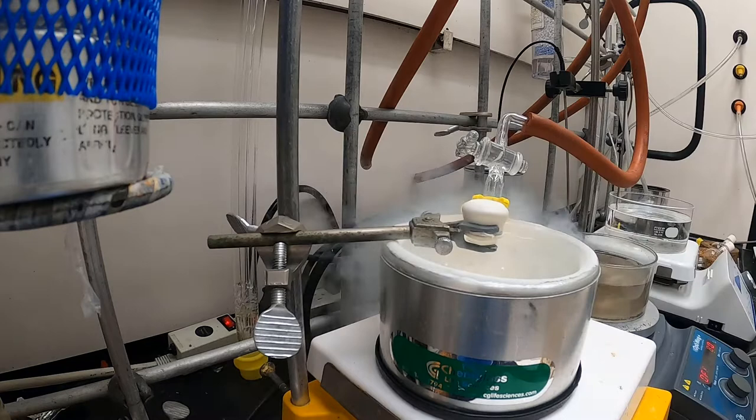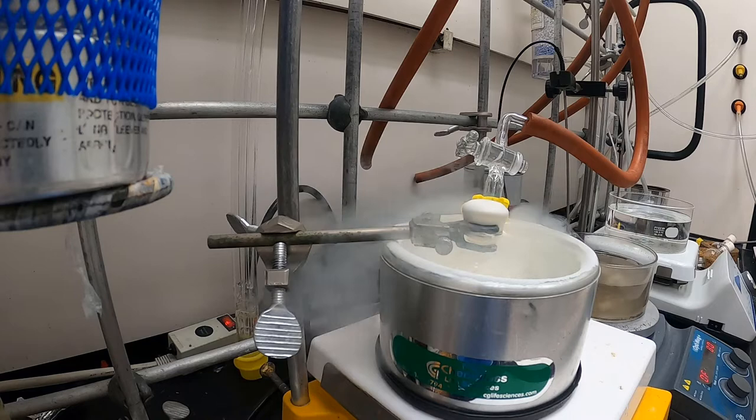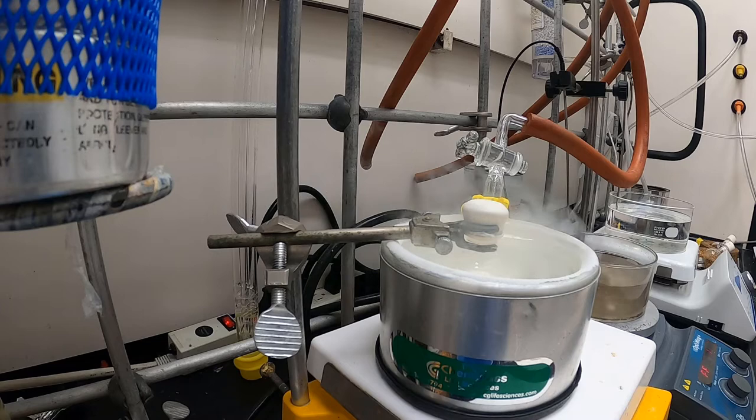And then I'll repeat this freeze-pump-thaw process two or three more times to ensure that all the air, and most importantly, the oxygen, has been removed from the flask. To be thorough, I'll include the whole freeze-pump-thaw process, but if you would like to skip to the next step, I'll put a link in the video.